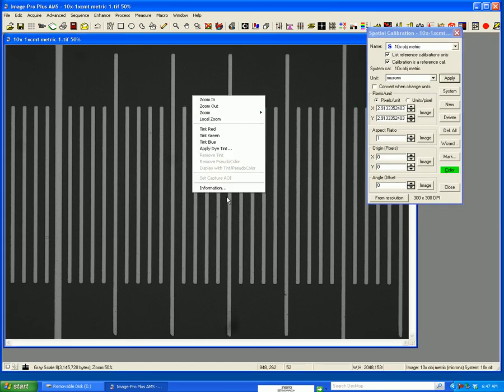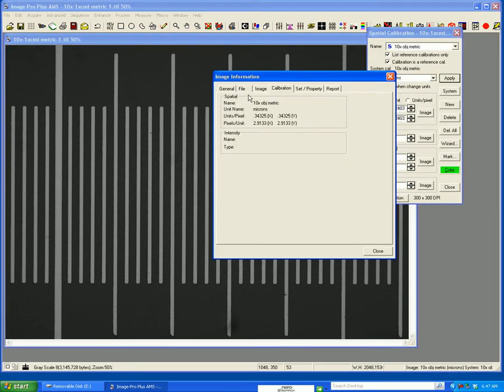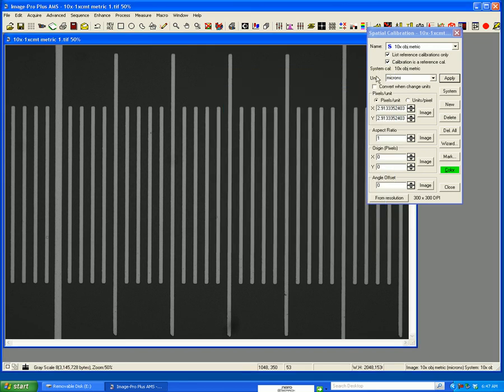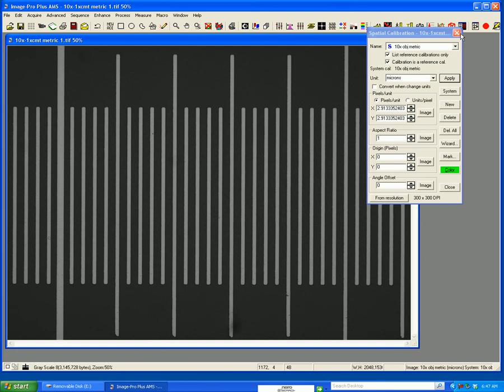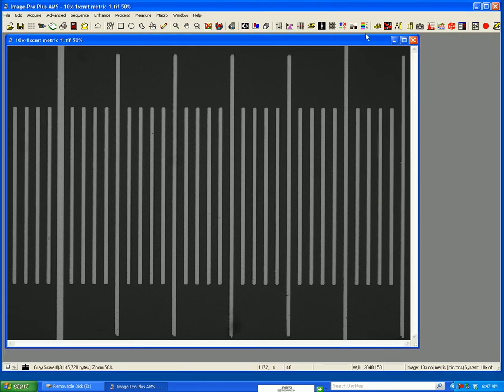If I right-click on the image and go to information, it tells me the size of the pixel. Now that I have calibrated, I want to verify this.